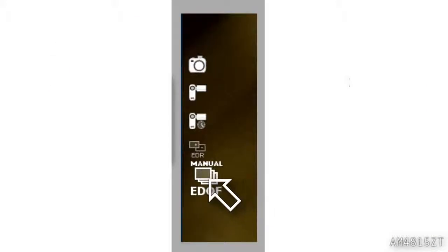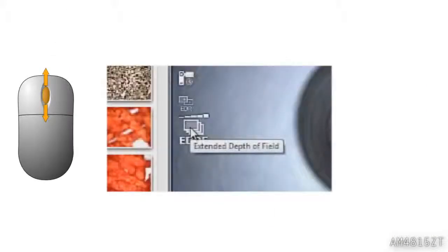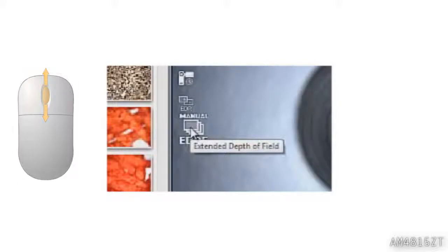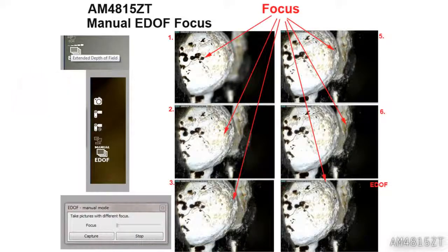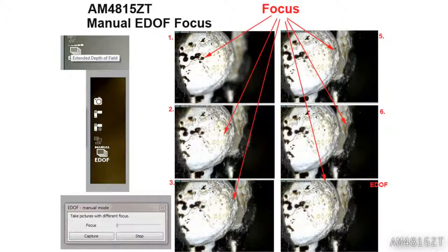Hover over the EDOF button, use the mouse scroll, and cycle to Manual mode, then click to open the menu window.